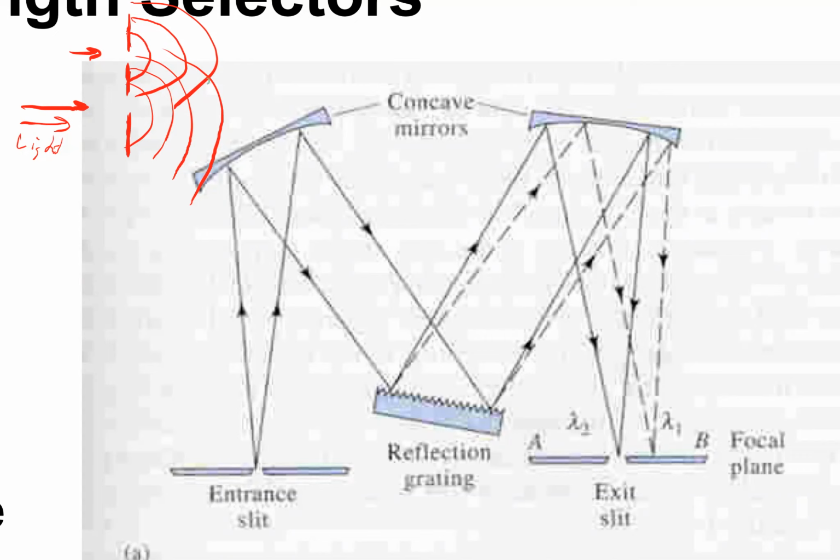And in those drawings, they make the point that at these points where the beams of light emanate from the slits and overlap in space, you can get what's called constructive interference.